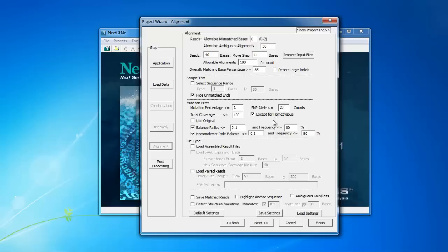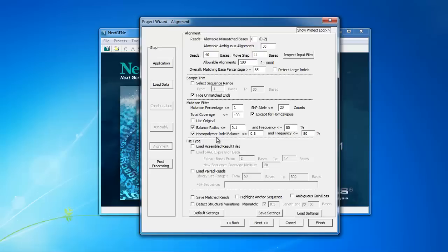There are some additional settings that can help reduce false positive mutation calls. Both the balance ratio and homopolymer indel balance settings work by checking the percentage of forward and percentage of reverse reads with a variant. Variants that are found only or mostly in reads of one direction are more likely to be false positives and can be removed from the results by using these settings.